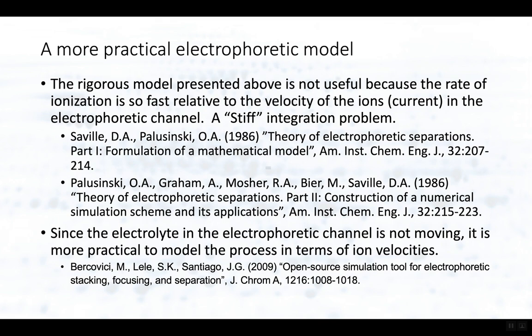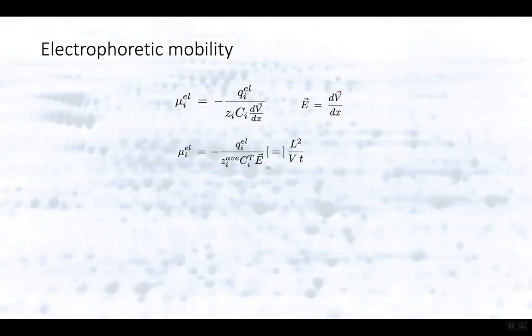Since the electrolyte in the electrophoretic channel is not moving, there's a more practical model that can address this, and this has been outlined by Juan Santiago and his group at Stanford, and they've developed an open source simulation tool for various processes in electrophoretic separations. Now let's talk a little bit about a more practical way to approach electrophoretic models.